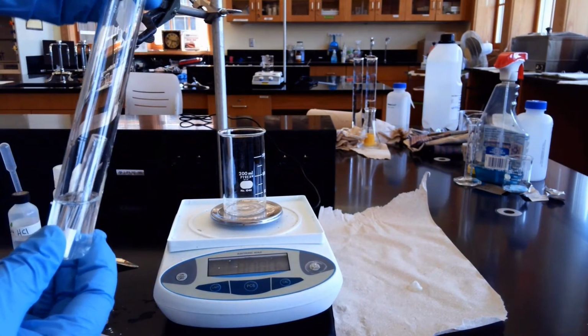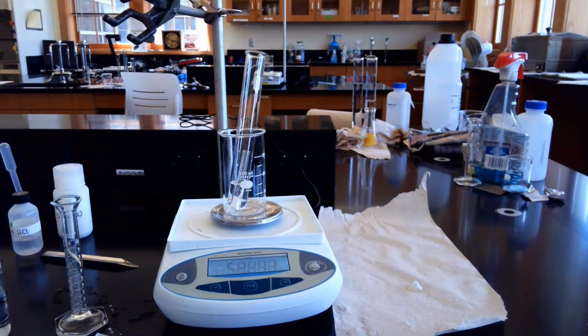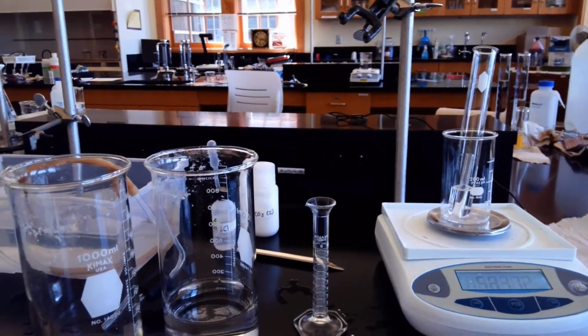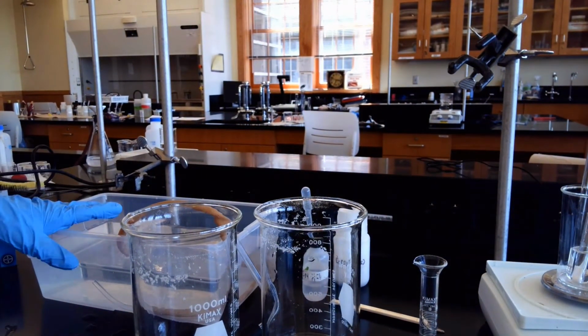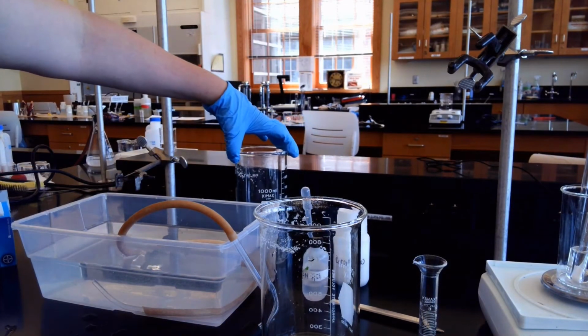So now what we have to do is just get the mass of it. So the mass of the gas generator is 58.372 grams. Now we're going to move it over here to the side. I'll just slide you over to our actual setup. So what I did is I filled this pan with water saturated with Alka-Seltzer.